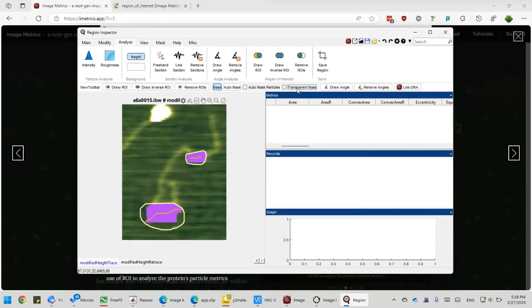And you see that although the first one is done a good job, right, because I cropped this in a more precise manner, but the second one, you see there's a little bit of shadows, I'll call that. I mean, the mask bleeds out beyond the protein complex. You can see that, right? And then we do not want that, right? And let me show you clearly if I turn off the mask.